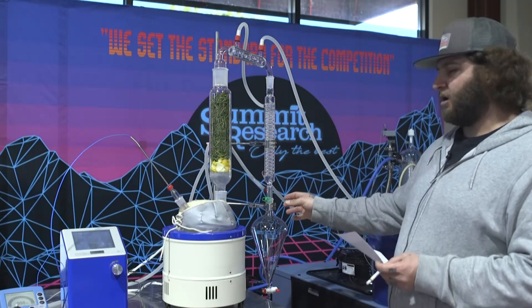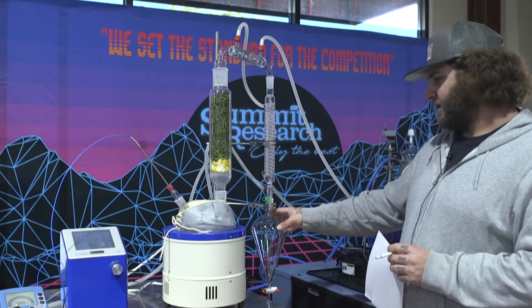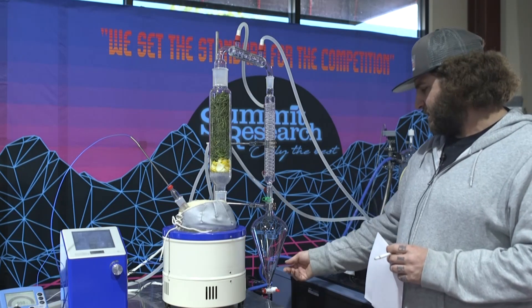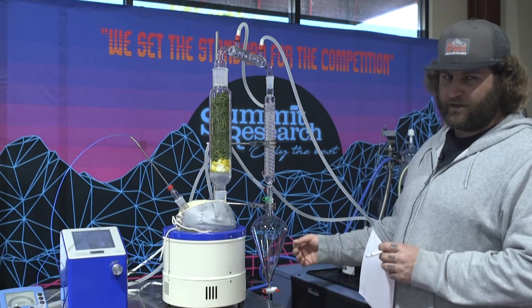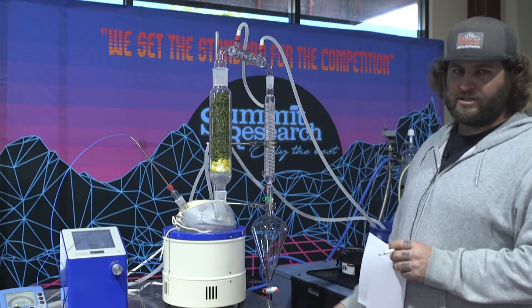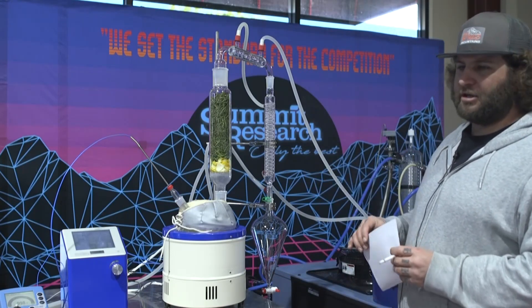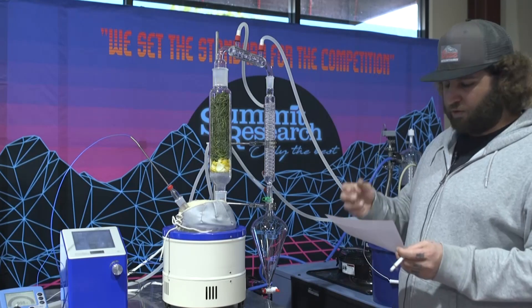We're going to harvest our terpenes into this flask. We can use a separator as well. What's going to be really interesting is we're going to separate them, get the hydrosol off, and then collect the terpenes. Another way of doing it is when you have enough terpenes collected, you can pour it over a drying compound or a sieve and that'll pull the rest of the water out.